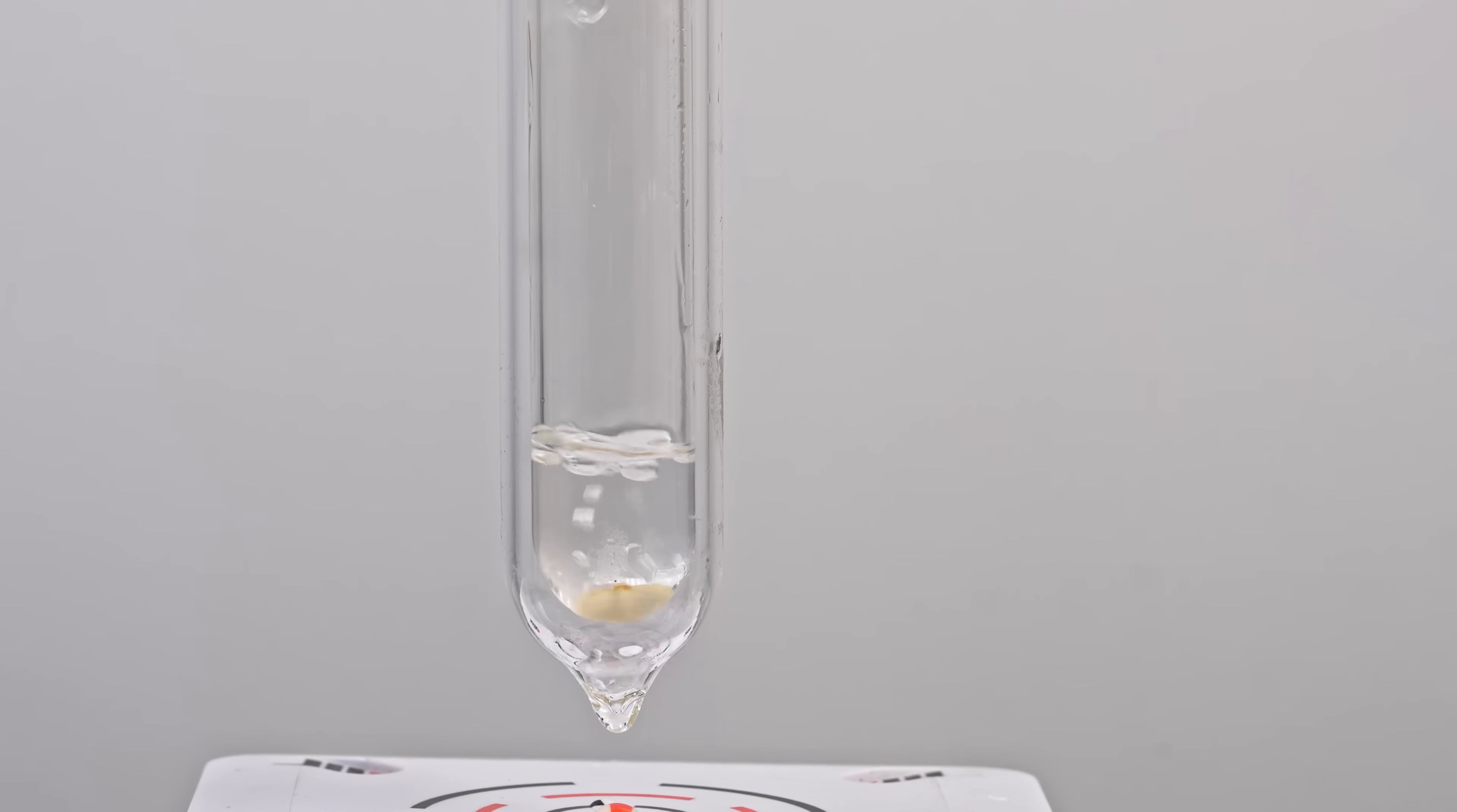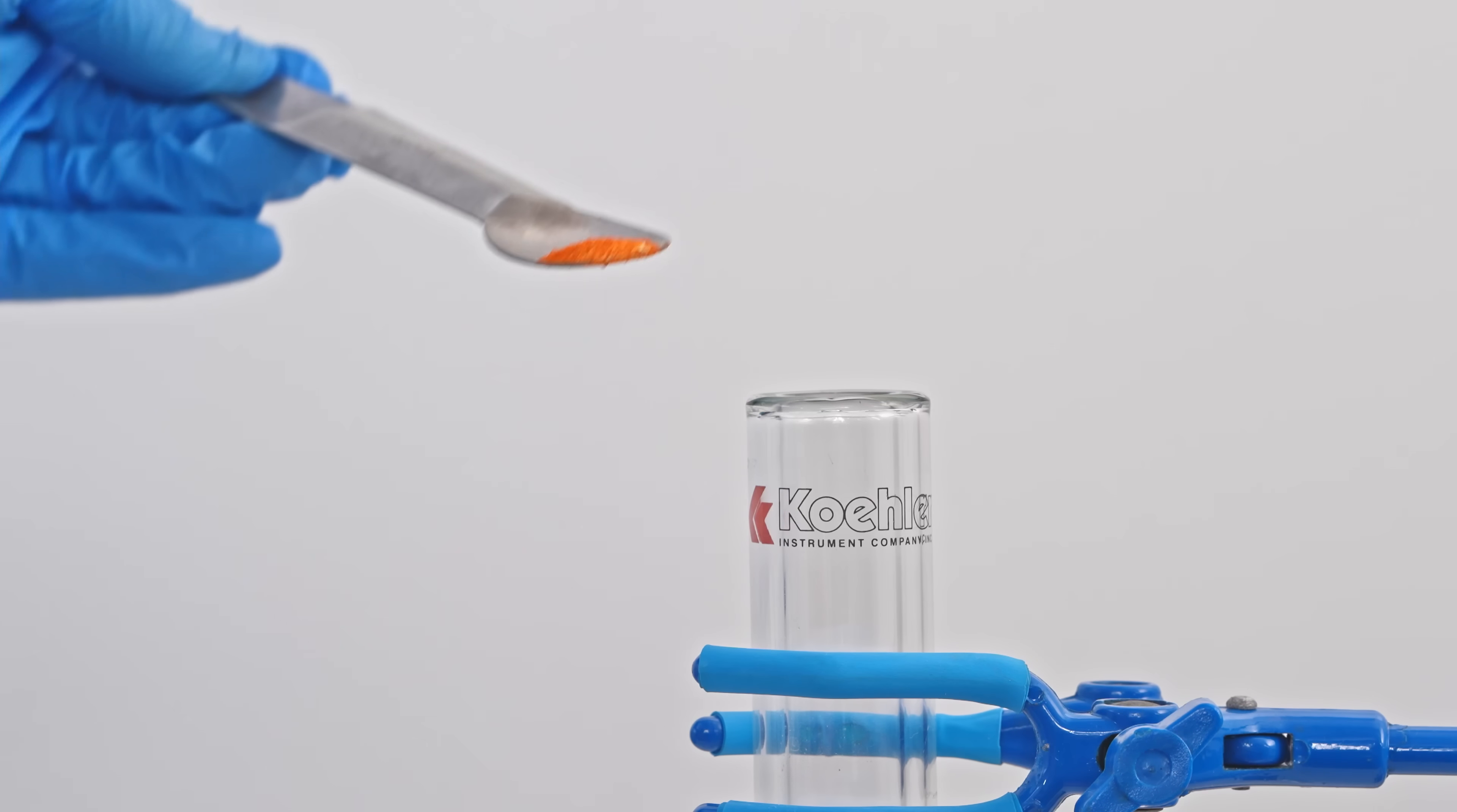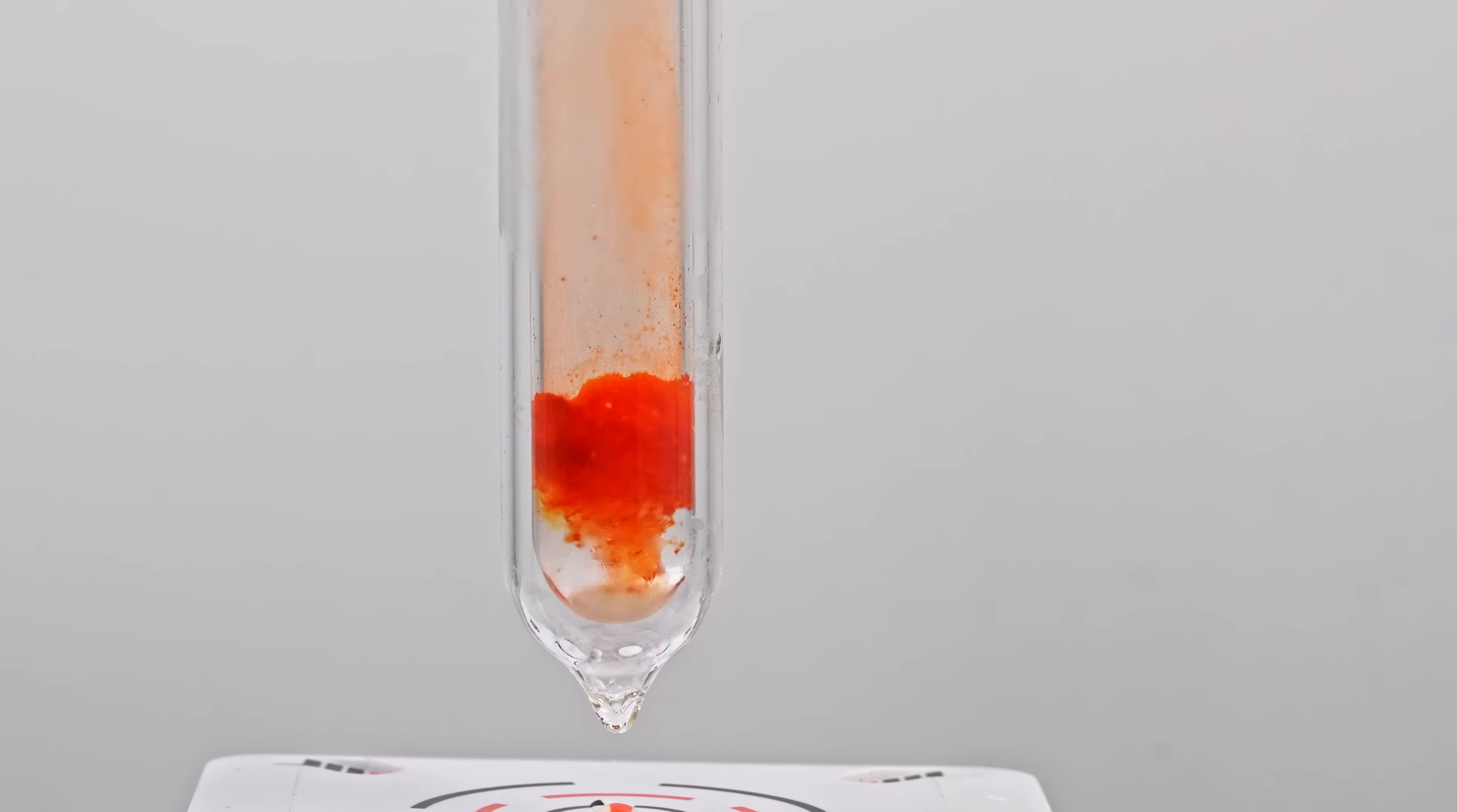If I pour liquid ammonia into a test tube and add a bit of potassium ozonide, the solution immediately turns a deep red, while the unreacted potassium superoxide settles out as a solid.